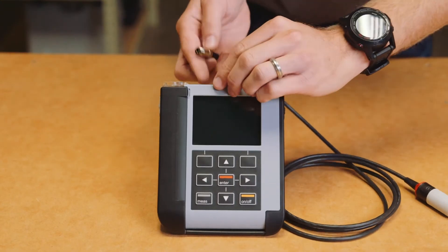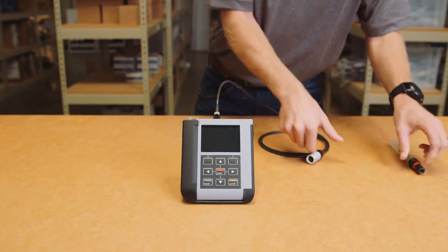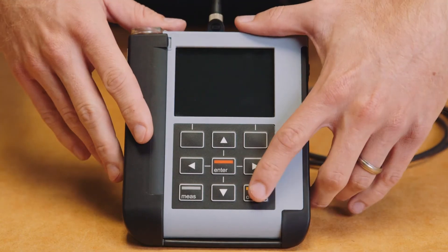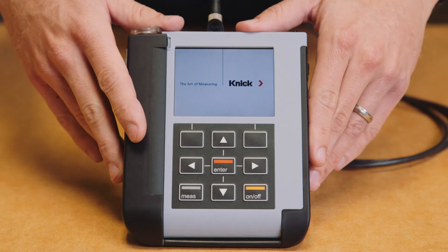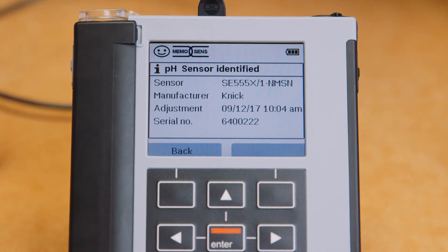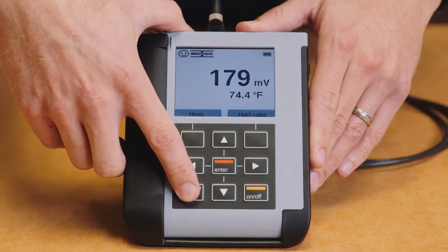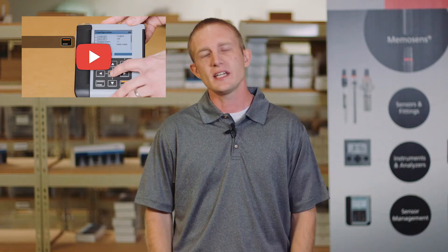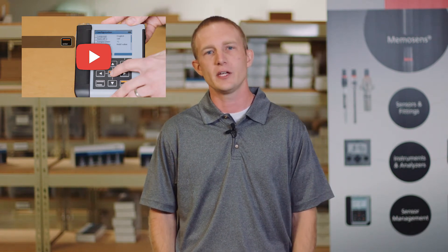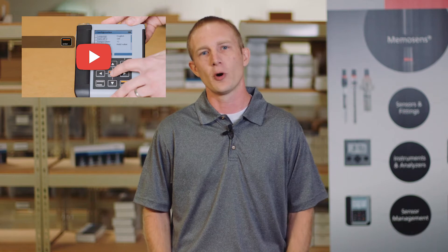Before you begin the calibration process, you must connect the MemoSense Portavo cable to the portable meter and then to the sensor. Turn the Portavo on and make sure that the setup and configuration has been performed. This can be verified by pressing the measure button twice to ensure that the date and time are correct. If this is incorrect, please watch our Portavo 907 Multi Setup and Configuration video before performing your calibration.